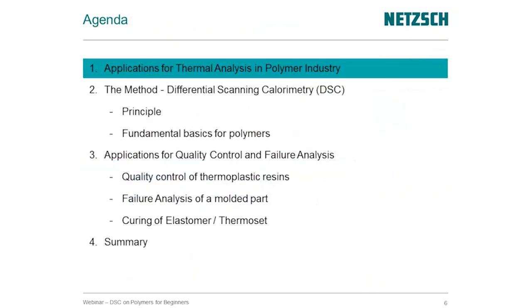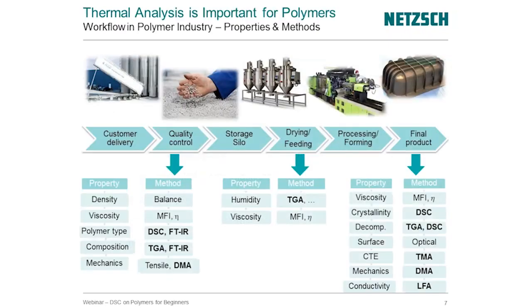So what we'll focus on today, after that brief introduction, is applications of thermal analysis, the DSC method, particularly in the polymers industry. It's probably the largest single market segment for this type of work. And we'll really dig into it and try to give you a better feel for how to use DSC in your daily work, areas where it can be useful, helpful, and then try to maybe give you some good background information as to how the instrument functions. And that might give you some ideas how to better apply it then in your daily work.